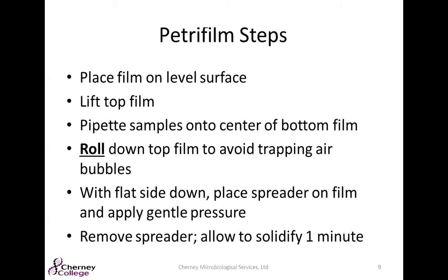So during your setup, you're going to want to place the film on a level surface. You'll want to just lift that top film aseptically and pipette your sample suspension onto the center of the bottom film on that plating zone. And then you're going to want to roll down the top film. Emphasis here on roll down the top film.